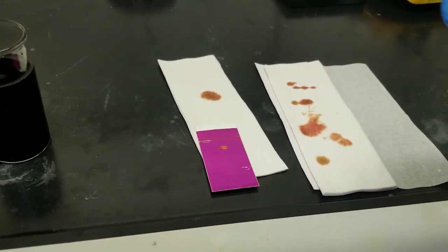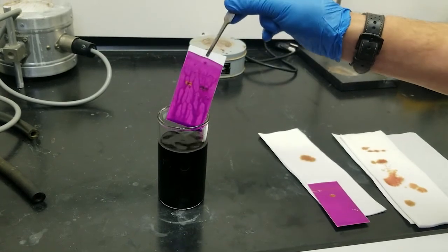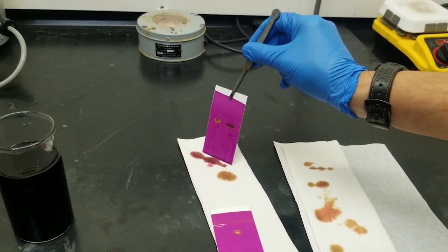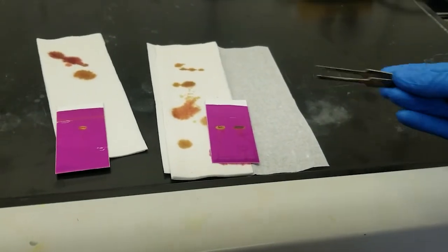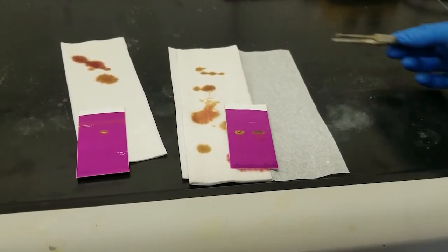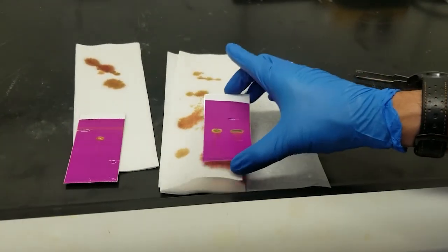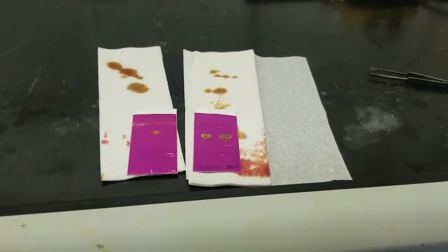So let me go ahead and do the other one. Once again, you just drop it in there, take it right out, and then touch it onto the paper towel to get the excess off, and then let it dry. For this particular one, just like before, you want to make sure you babysit them a little bit, because if you stain them and walk away, over time this whole thing will become a brownish color, and then you can't see anything. So yeah, I'm only really seeing my pencil marks on there. So this is actually not the best method for these particular compounds. UV is better, but I just want to illustrate this is an alternative if UV is not working for you.